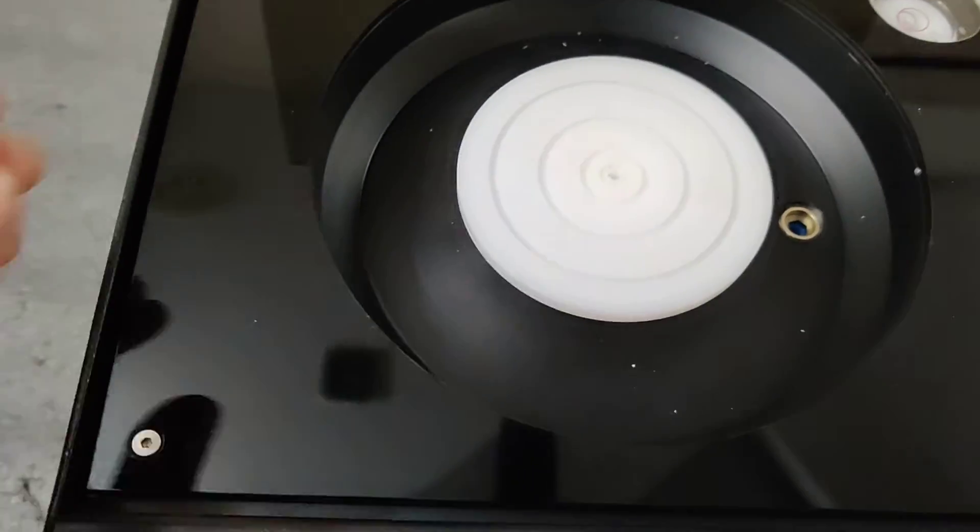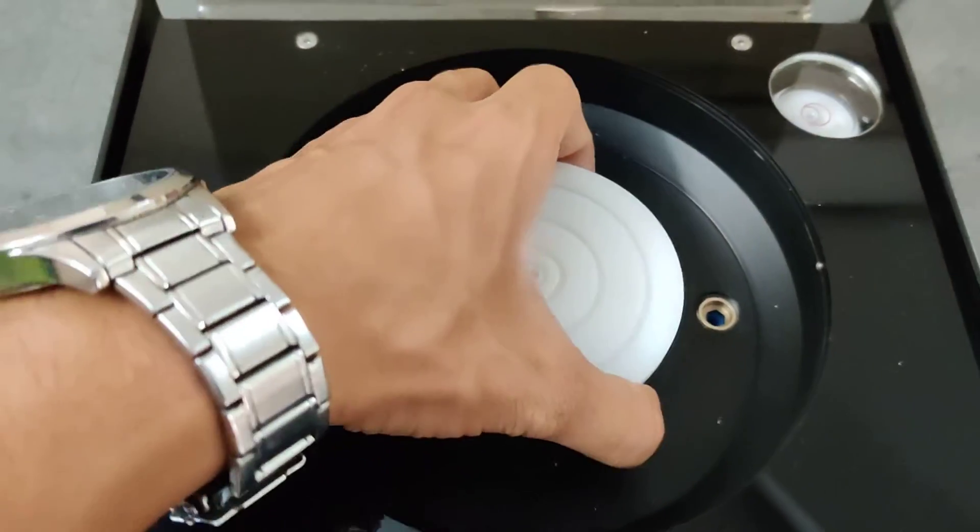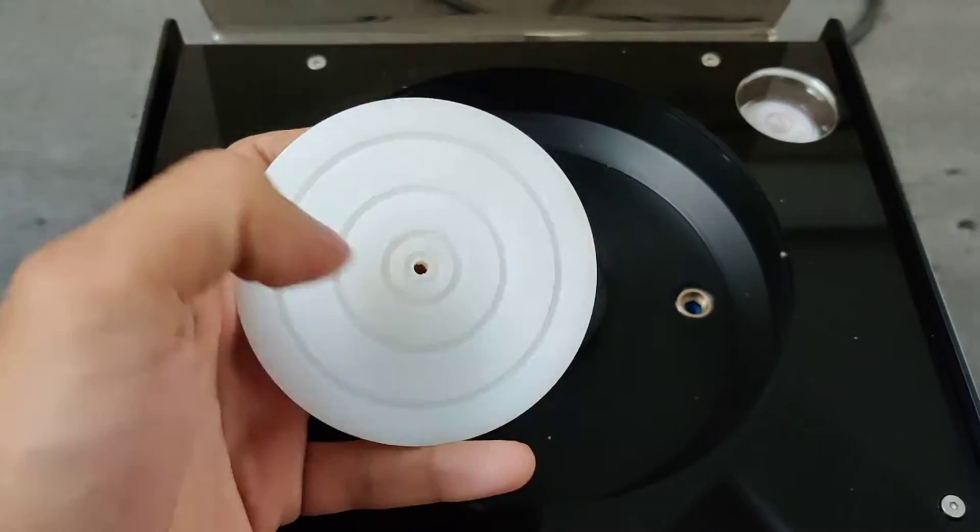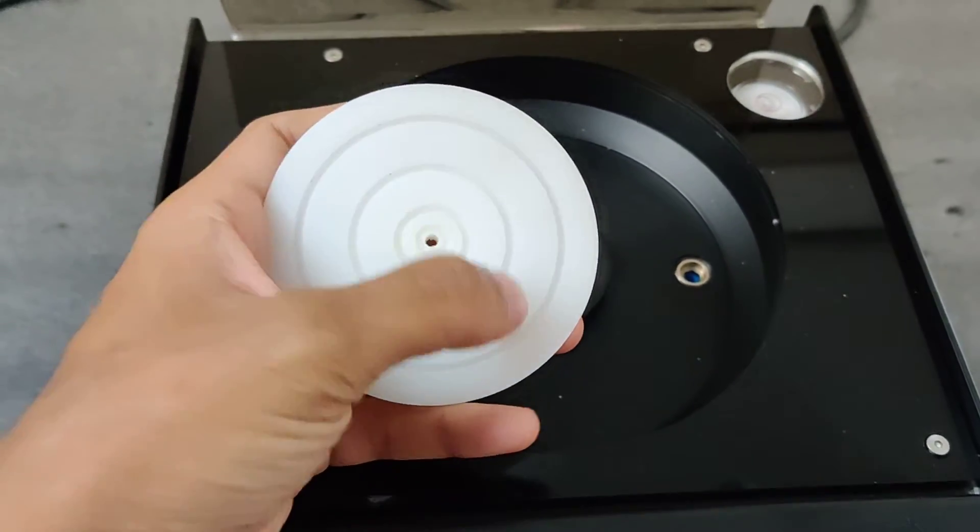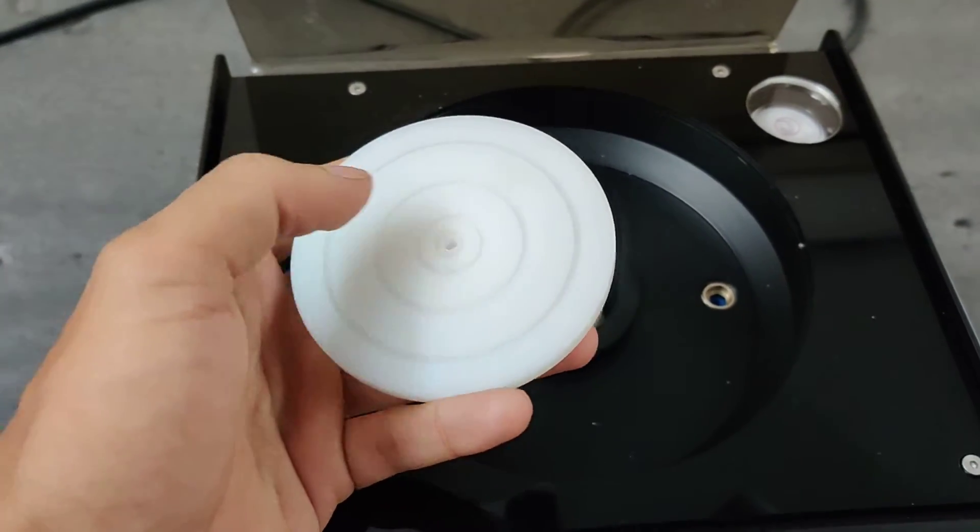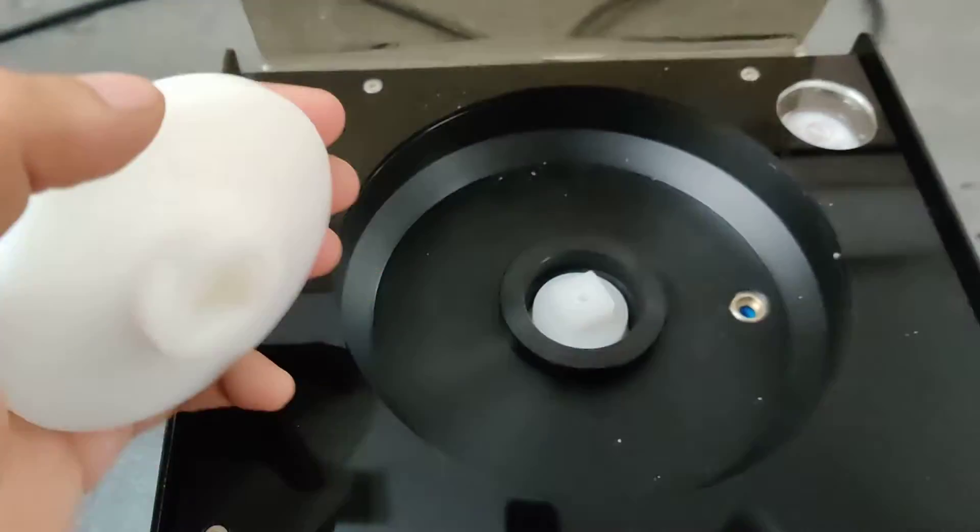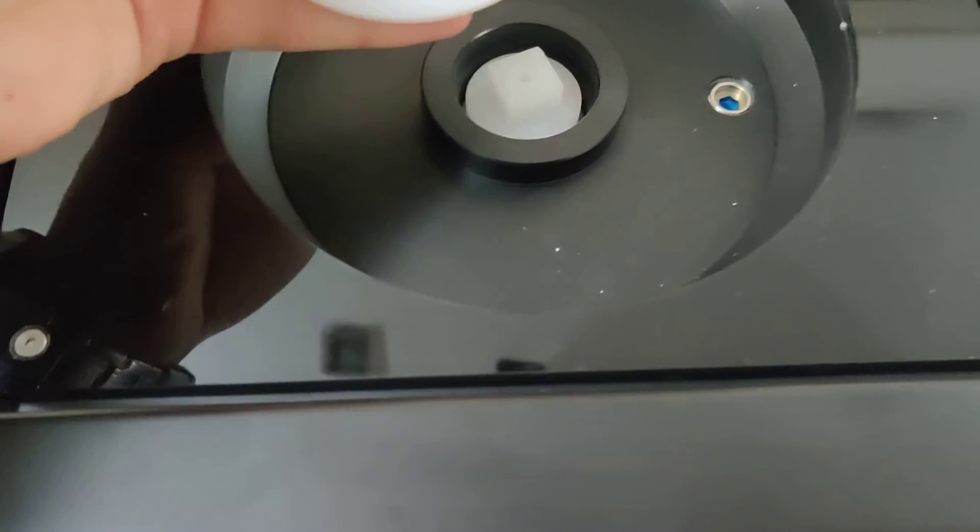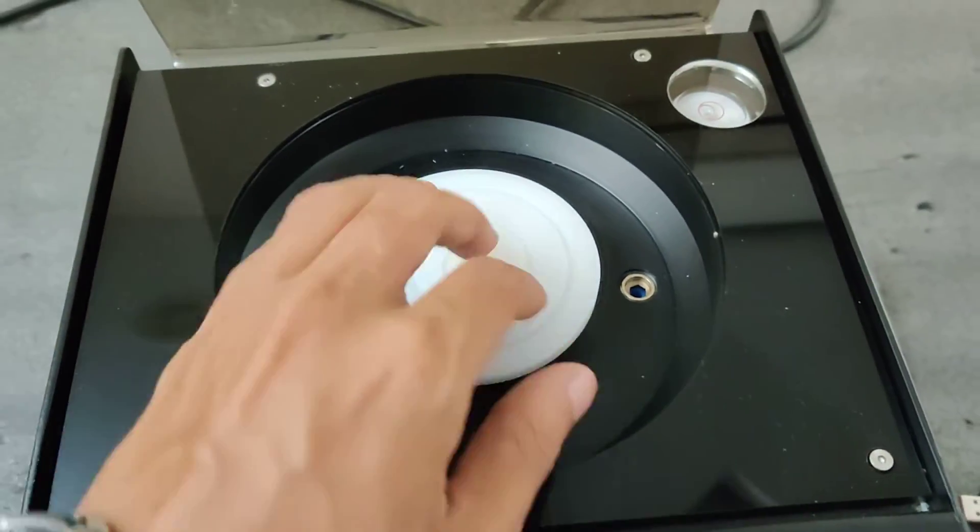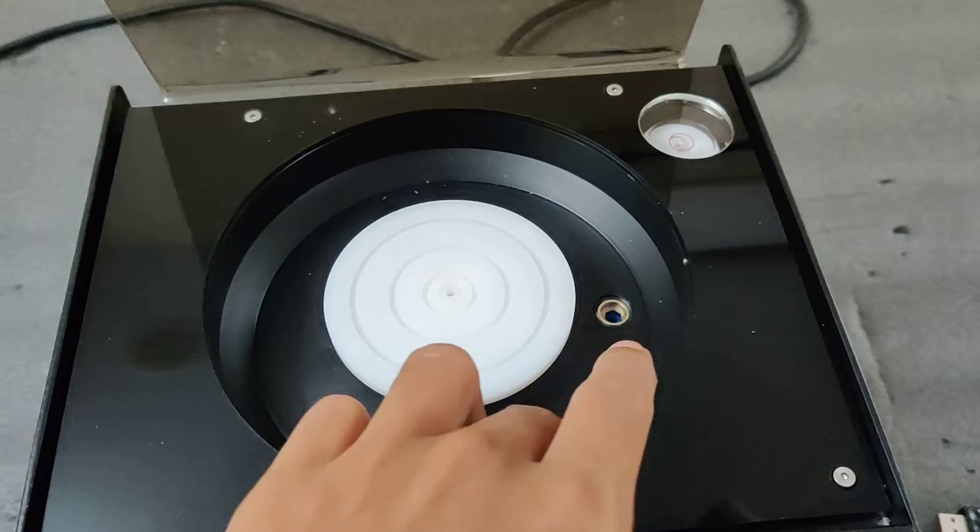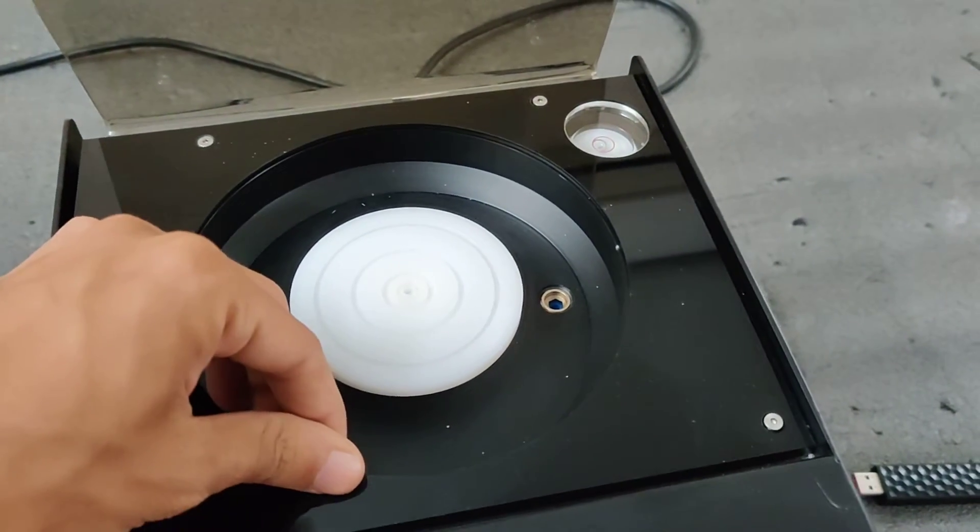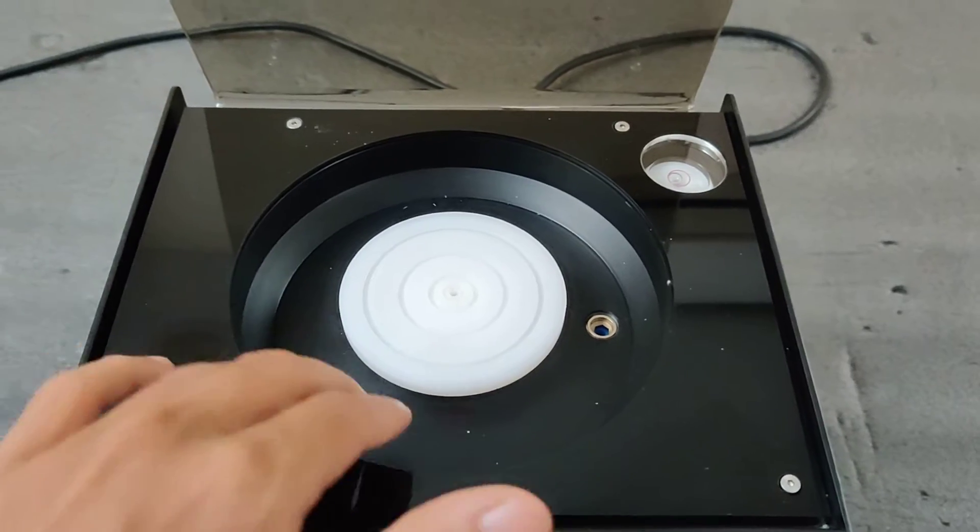This is the chuck with different size O-ring capacity, so that whatever size or substrate you have, you can place a corresponding O-ring and use it. It's a push fit chuck, so you can easily take it out and clean it. This is a drain port and this is a Delrin bowl, easy for cleaning, chemical resistant bowl.